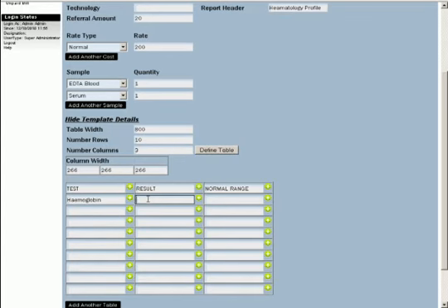Once done, it shows a block or a grid format. Simply enter the values as shown. Here in the first column we are entering all our labels, that is parameters for which the testing is done. Next is the result column. Here we will define each result with a name. This is useful in making formulas or while sending SMSs, as these values are then automatically picked up.